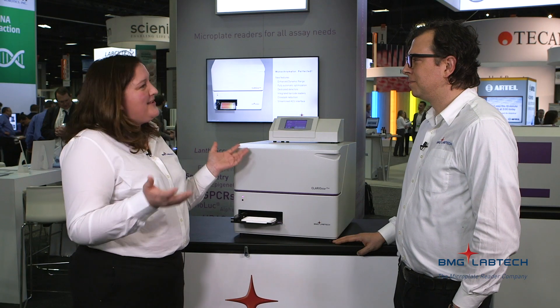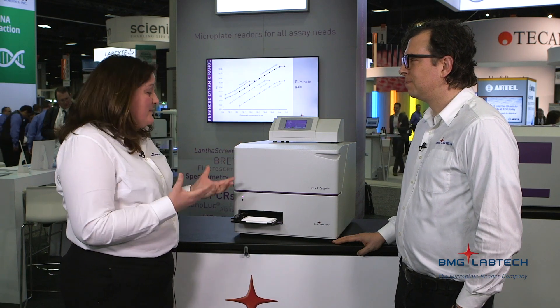A lot of labs are using more and more red dyes — redder is better. We definitely see that. And this means you get the best performance, best of both worlds.